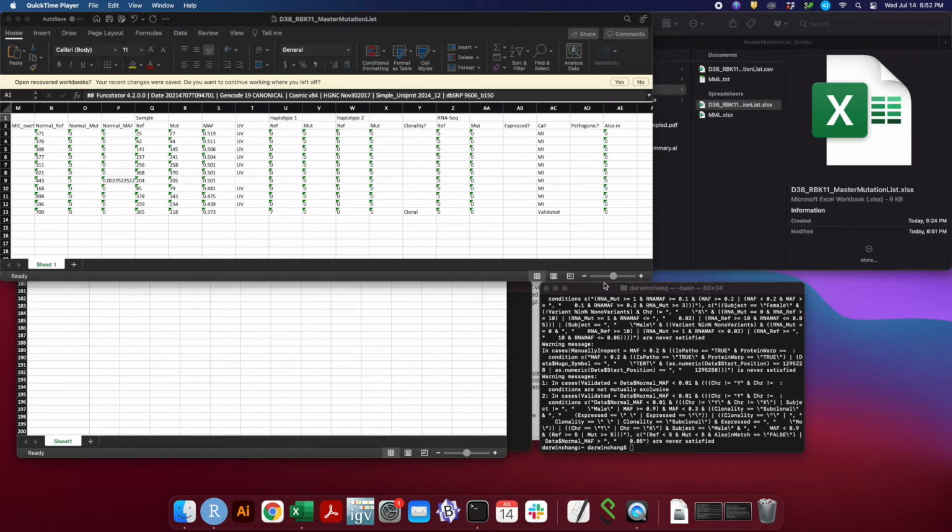My name is Darren Chang, and today I'll be showing you how to find clonally related cells and identify additional mutations, as well as determine whether or not the cells are clonally related in situ or culture artifacts. This step can best be done with two cells that are related to one another. However, this can be done with 3 or more related clones by doing this repeatedly over unique pairs of clones.